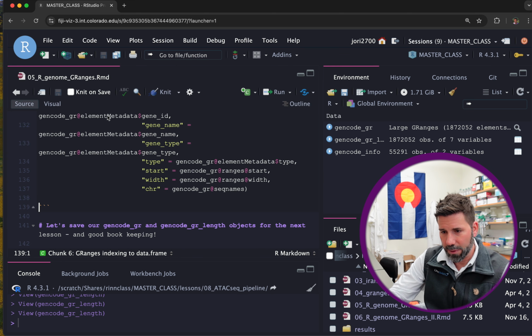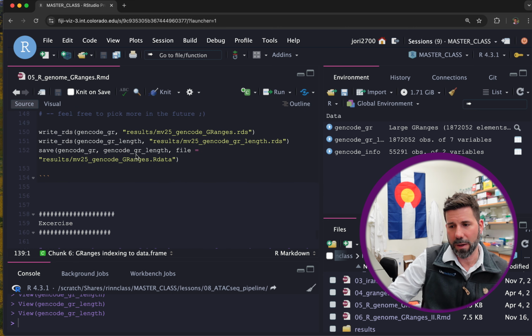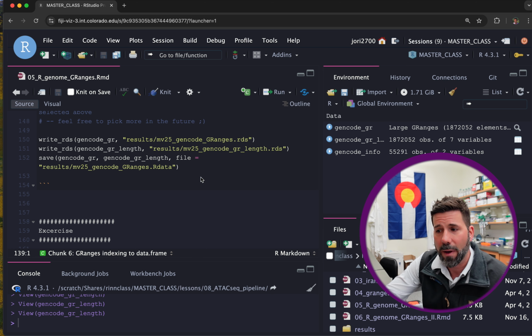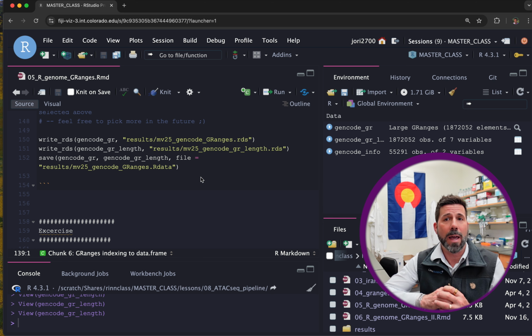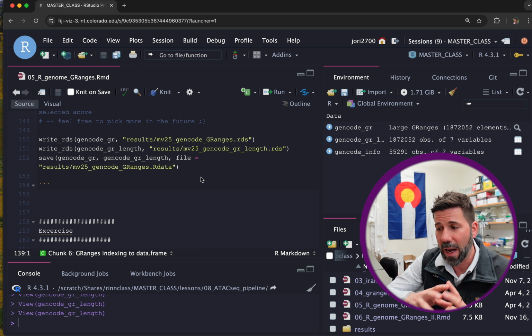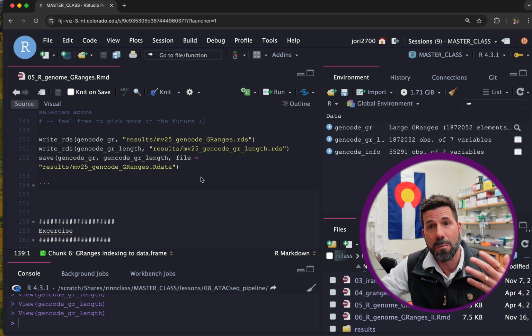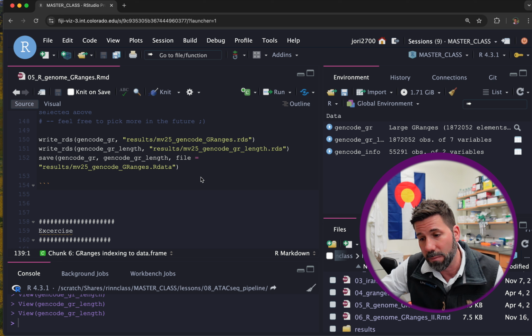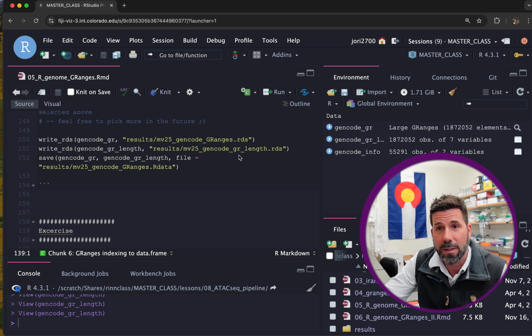Okay, so that's a really handy table we'll probably want to save at the end, and here we go. There we are. We're at the end. Feel free to save this, and then you'll have that nice handy table with all these gene features. And when we look at our RNA-seq data again, or the ATAC-seq moving forward, we can ask, are they next to long non-coding RNAs or protein-coding genes? Is there a difference? And we can add that level of analysis of any of these genome features. We can add that multiplicity of analyses to our research plan on looking at how dox affects ATAC-seq data.